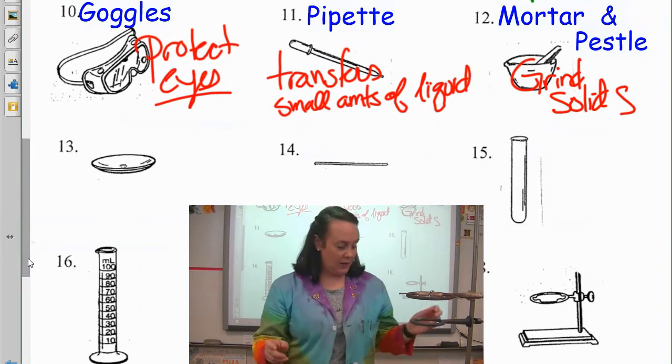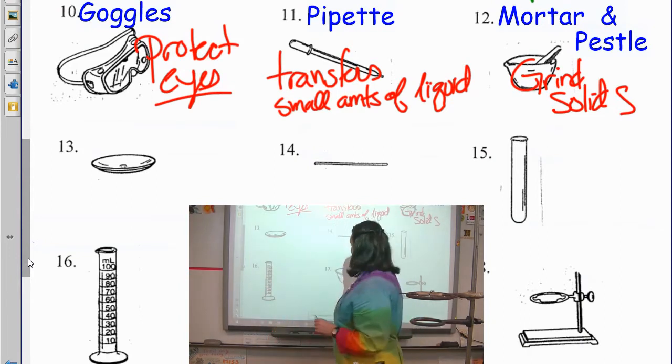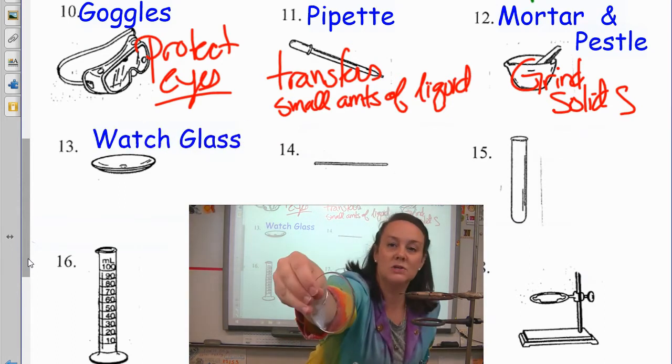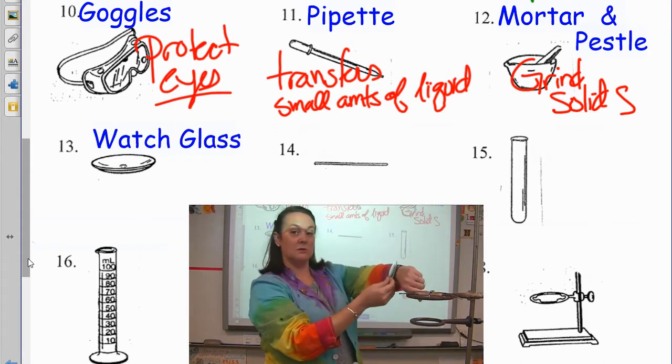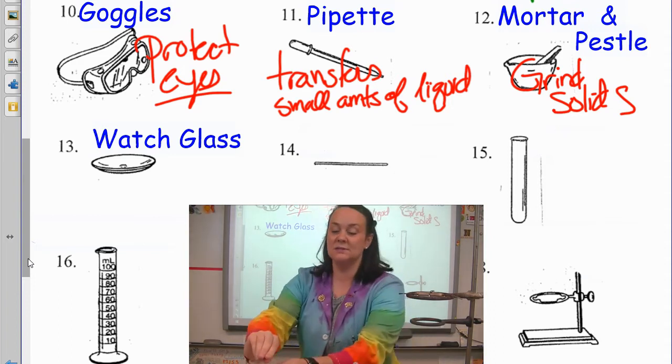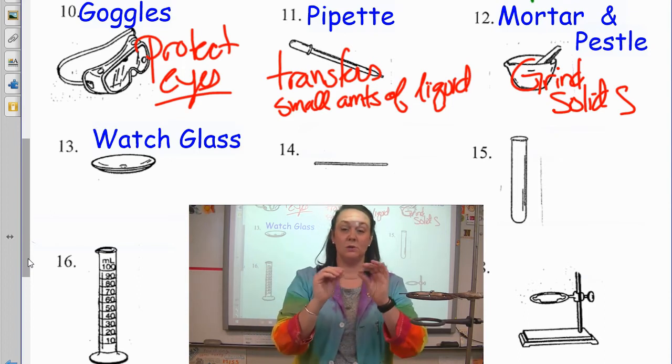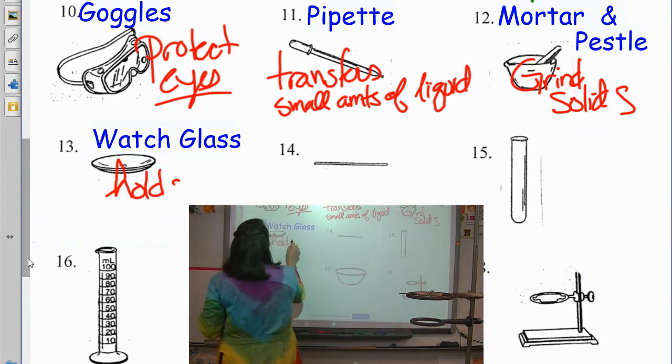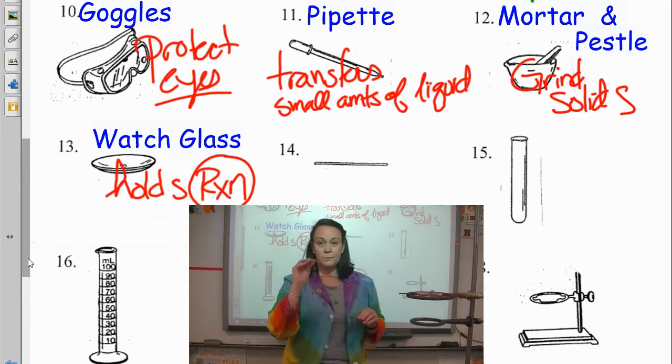Thirteen looks a little interesting. Let me find him. Thirteen is called a watch glass. I know it looks pretty. And maybe I'll take some pictures of these. But it's just a piece of glass, a watch glass. And it comes because it looks like a glass out of the front of a watch. They can be used as lids to cover up a beaker. But the number one reason that we use these is to hold a reaction. So, hold. And I write reactions like that.